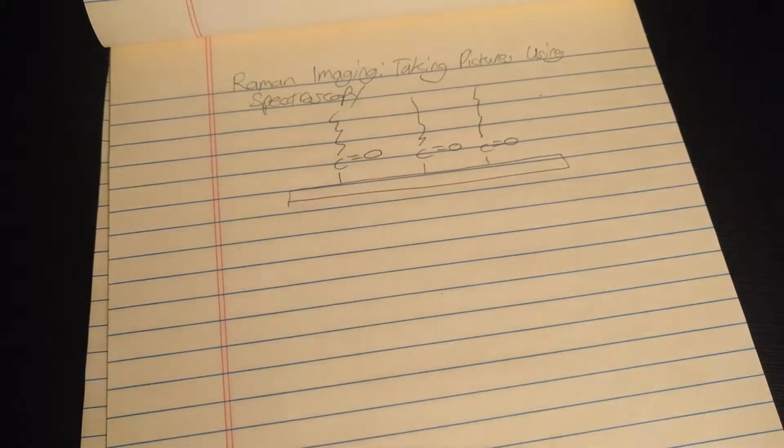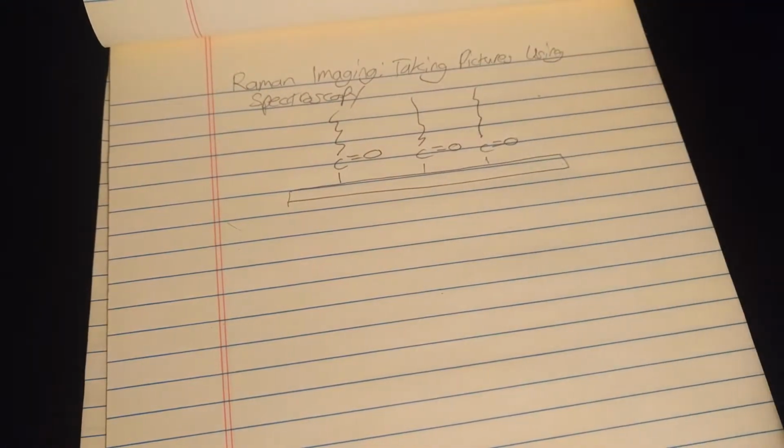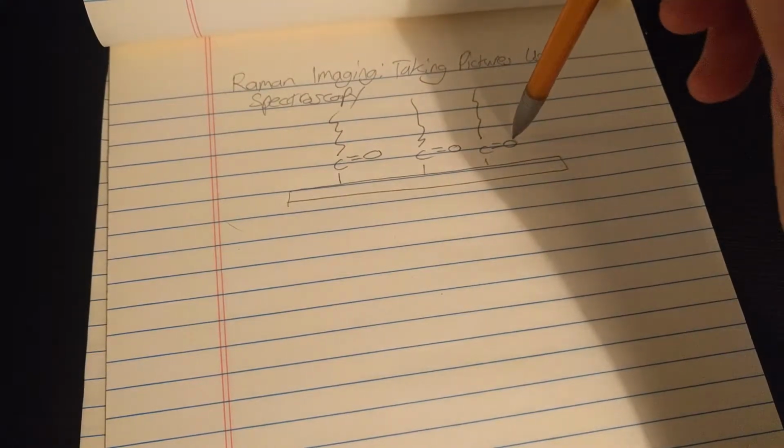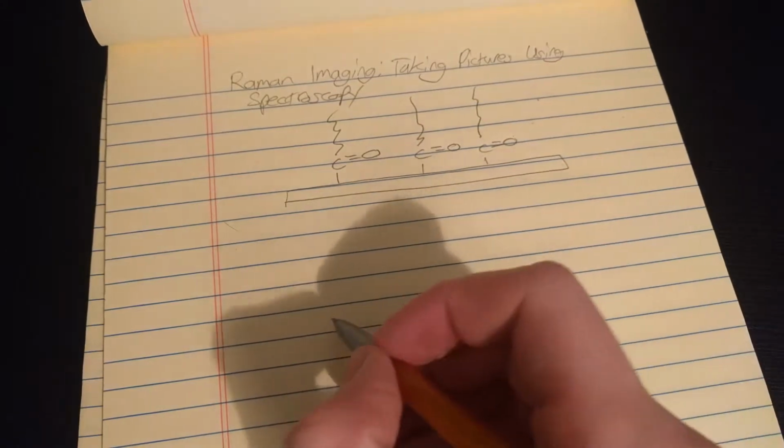Now imagine we take a laser and we point it at this sample because we want to take a Raman spectrum. Imagine we point our laser in different spots. The first spot might be way over here to the left. The second spot is a little closer to the center. Third spot's in the center. Fourth spot a little bit to the right. And then fifth spot all the way to the right. Sort of like the following.